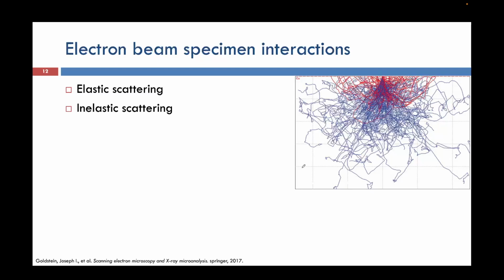Just before, we said that our Dmin, let's say I am talking about 1 to 2 nanometer for an FEG gun, right? If we are talking in the order of 1 to 2 nanometer, then why do we have to talk about this term called interaction volume when the electron beam is incident on the specimen? Why do we have to see that in that case?